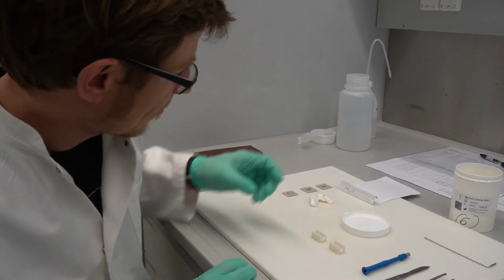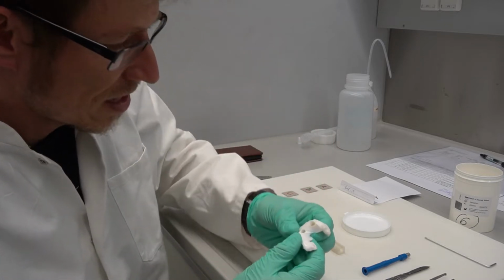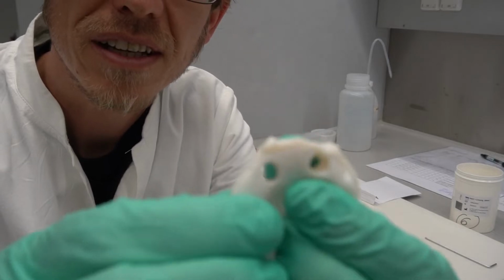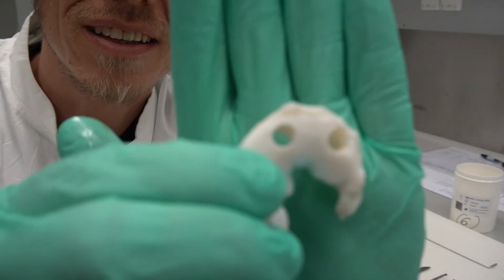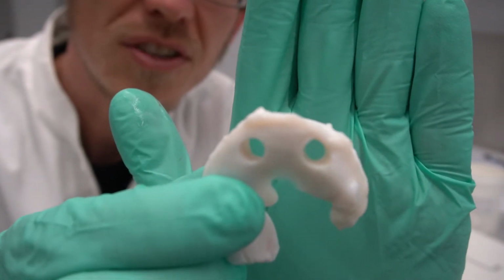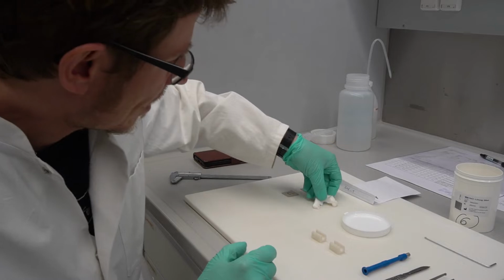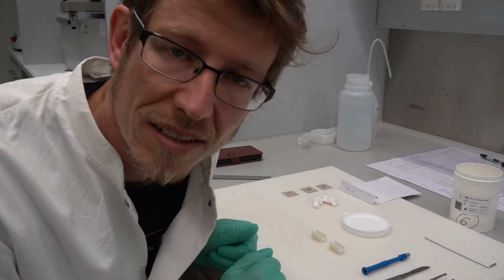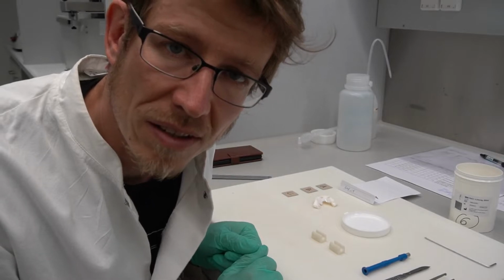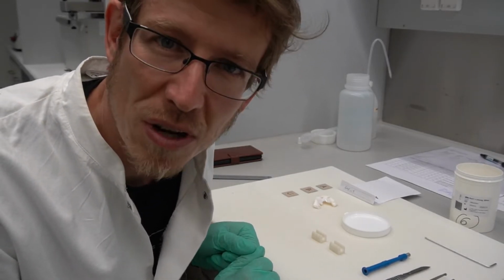For doing this, I take a meniscus like this and I punch out cylindrical samples. Maybe you can see this here. There are 2 samples already punched out. They have a diameter of 6 millimeters, and they are tested in our small testing machine in saline solution. So I will show you how this works.